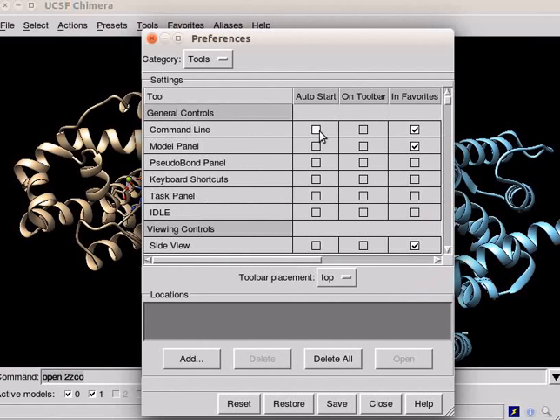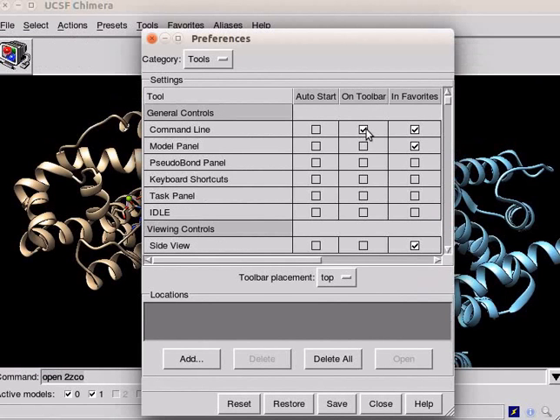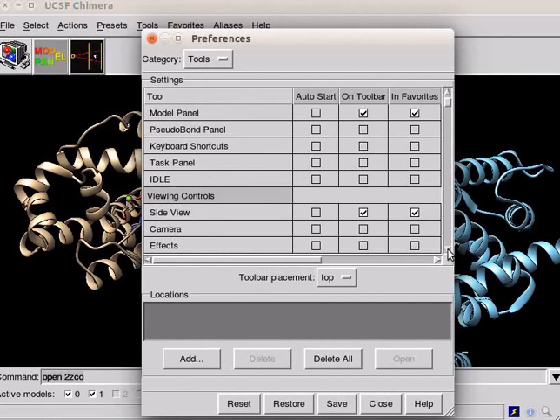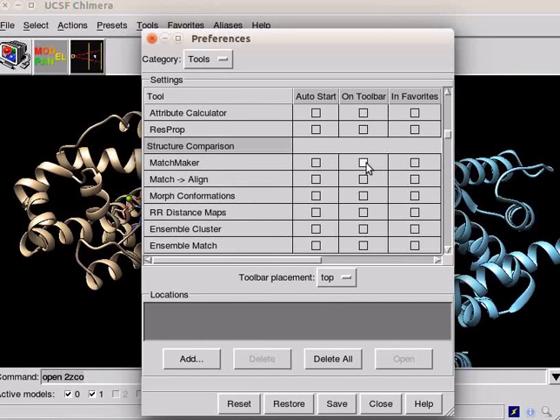Check the boxes for command line, model panel, side view. Scroll down and click on matchmaker and match align.